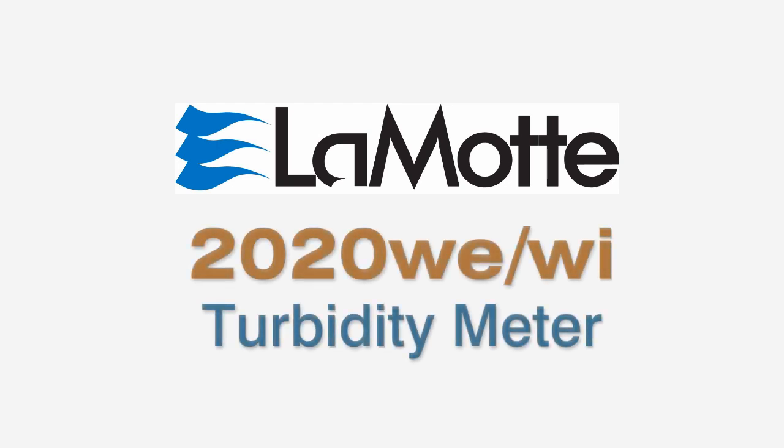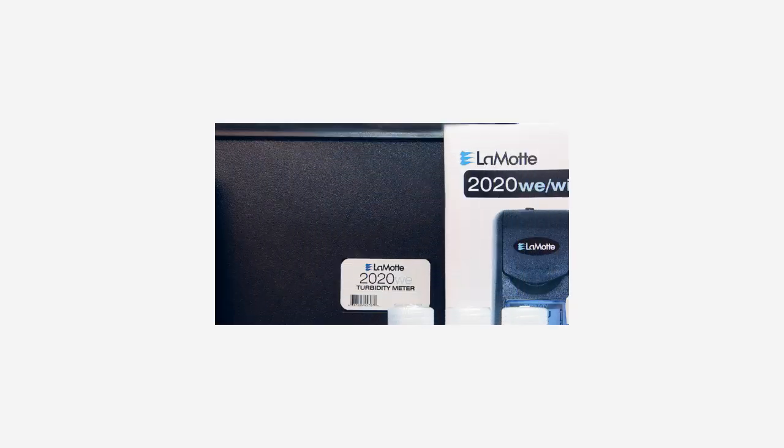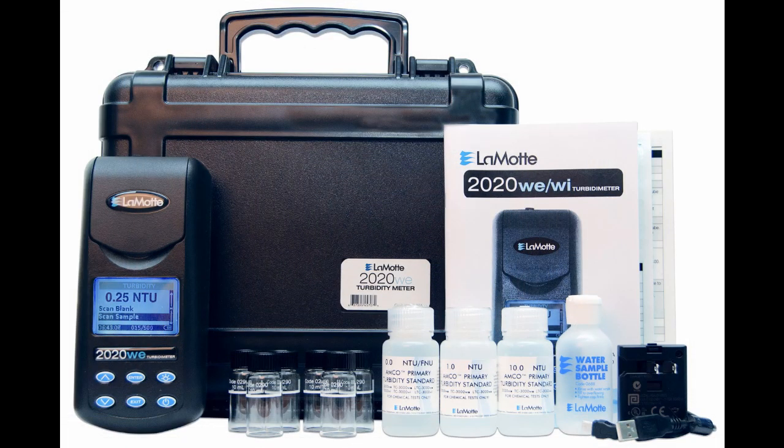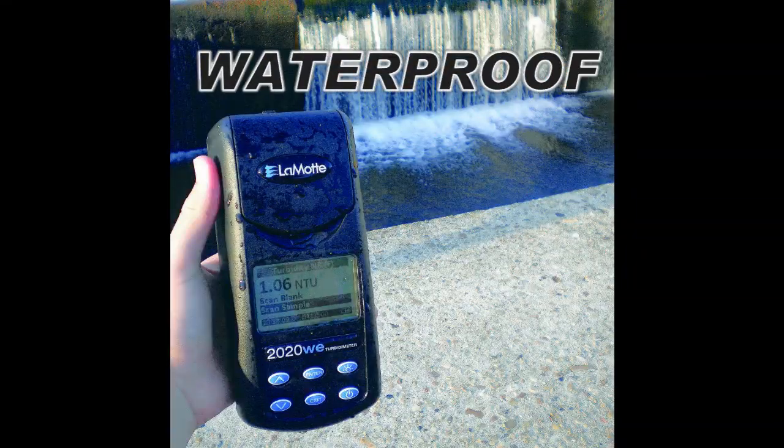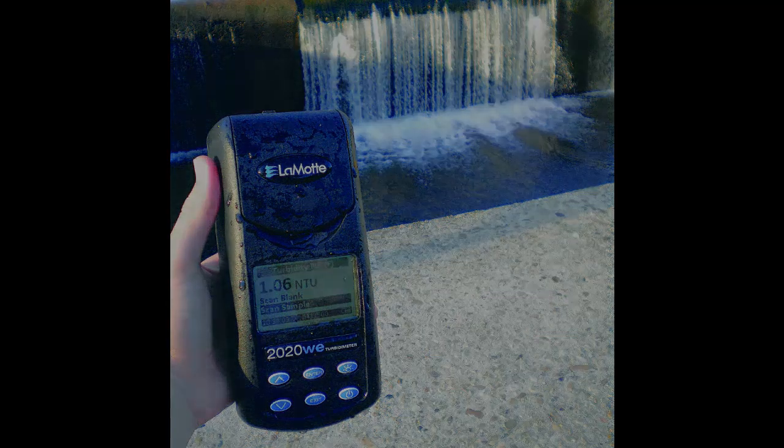This video demonstrates the basic functions of the LaMotte 2020we meter, which is compliant with EPA turbidity regulations, and the LaMotte 2020wi meter, which meets ISO turbidity requirements, including startup, calibration, and measurement of the turbidity samples.